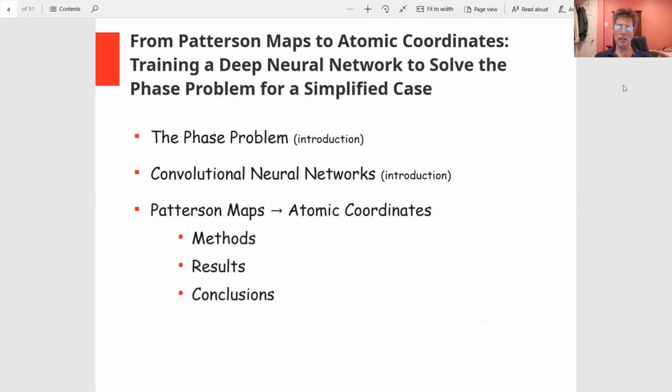This is the outline for the talk. In the first video that I made, I gave introductory material about the phase problem, what a Patterson map is, what a neural network is, and what a convolutional neural network is. All this introductory material is covered in the first talk.